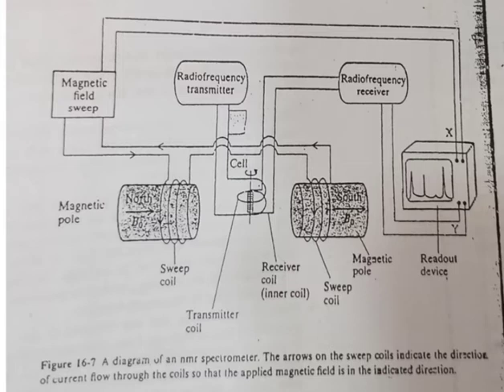Or another way is here: the magnetic field sweep to the north pole, to the cell, to the readout amplifier or the radio frequency receiver, then goes to the readout device. So two-way analysis can be done. One time the magnetic field is kept constant and the radio frequency can be measured on the instrument or a readout device. Or in a second condition, the radio frequency is kept constant and the magnetic field is changed. At that time the detection is done on the instrument.